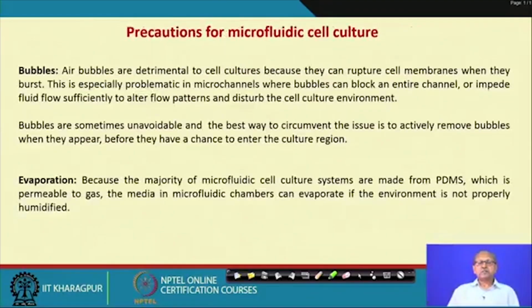Bubbles are very detrimental to cells because cells adhere to the bubble surface, and when the bubble bursts the cell dies or is affected. So, you have to manage it so that bubbles are not formed during the inlet or in the culture channel.